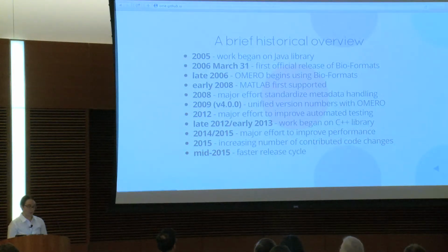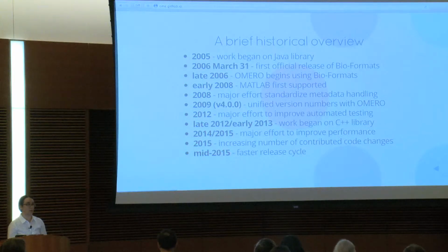Around the same time, the first versions of the OMERO data management system, which some of you saw this morning, were being released. And so in late 2006, OMERO began using Bio-Formats to import files as well. In early 2008, we added official support for MATLAB through a set of example scripts, and that's evolved into a more robust MATLAB framework, which is widely used today.